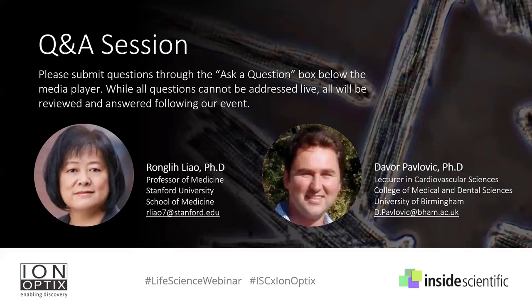So if you're asking what the success rate is, in other words, that we get some cells every single time, with the injection method I would say that's a higher success rate than with the Langendorff, at least in my lab. That's probably because the Langendorff system is trickier to clean, and it takes longer from the heart to the cannulation. But that's our experience. On the number of live cells, we find there is a slight benefit of using the injection isolation. I would say the number of live cells tends to be around 60% or something like that. That's the yield that we normally get.